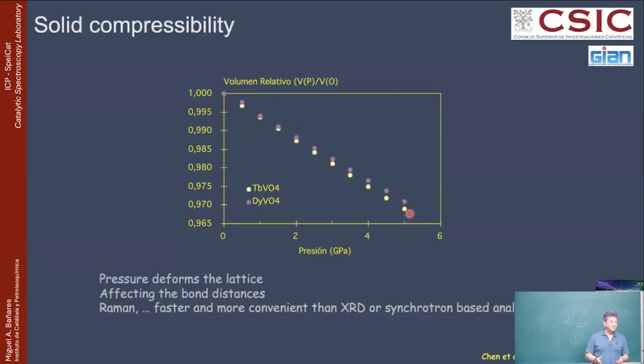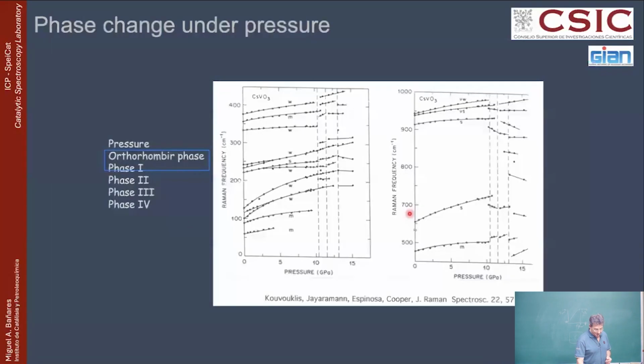So that means that almost any basic Raman system of 2020 will be able to do what a 1992 Raman system was doing, because in the last few years, as you will see in a moment, Raman spectrometer quality has increased exponentially. I'm not exaggerating if I tell you I can have a Raman spectrometer in my pocket, because right now there are Raman systems that can fit into your pocket, and not a big pocket, even a small, very small pocket.